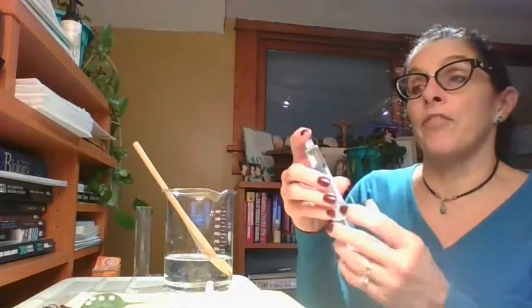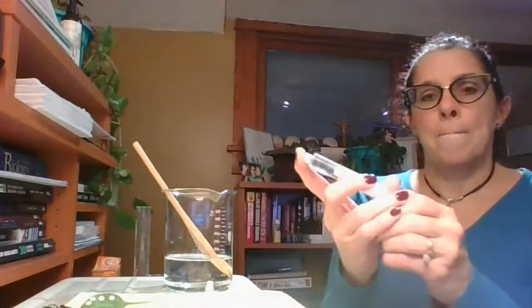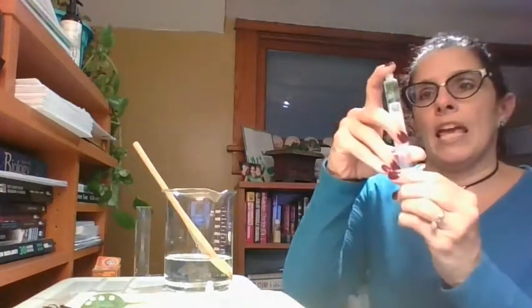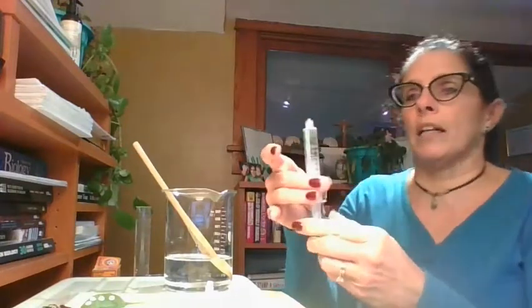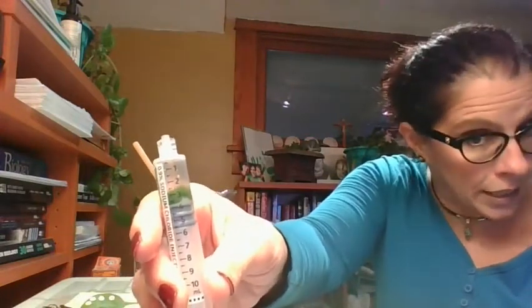So I'm going to put my thumb or my finger over the tip, hold this here, and pull it back and shake it. And this is when I say this is difficult, because you have to shake it, probably you have to try it multiple times. When you put these puppies in here, they float, but if you've infiltrated them correctly, and I think I did it actually with one trial, they sink. I want them to sink.